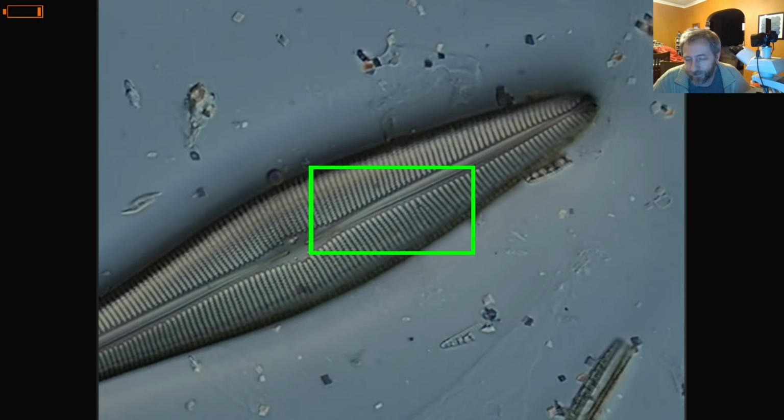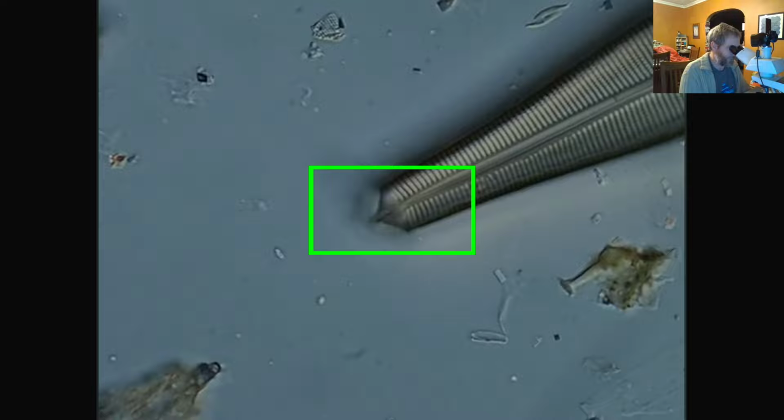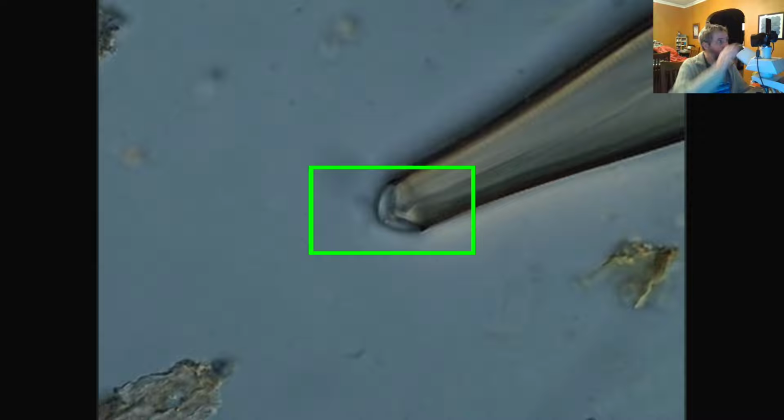I don't think your microscope would be able to see it. You want me to do the trick? I can do that. So I can do a little bit of manipulation of the light associated with these apical pore fields. If I zoom in, we were seeing them kind of refracted right here, right?